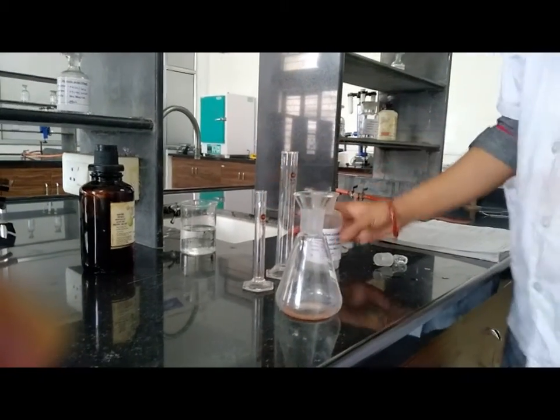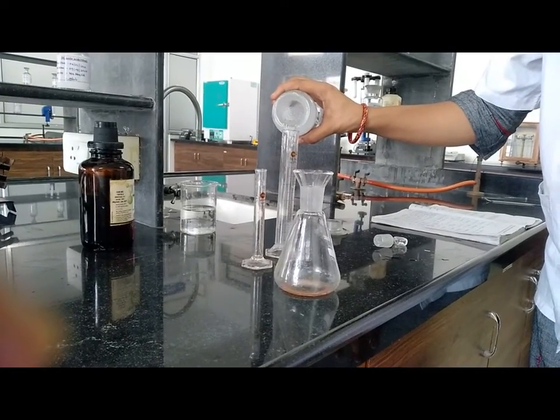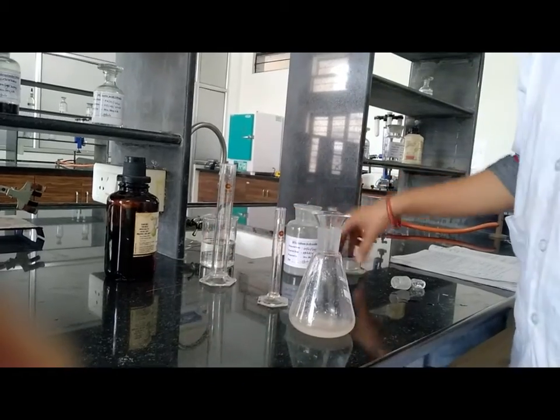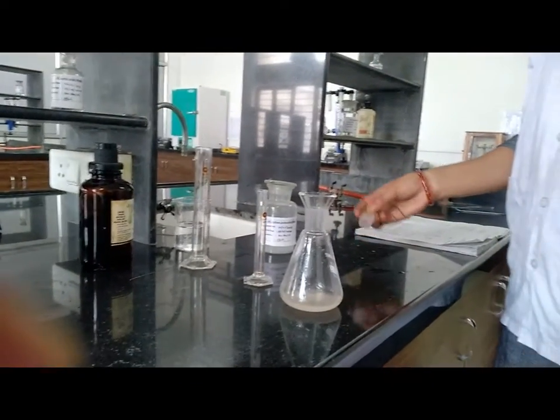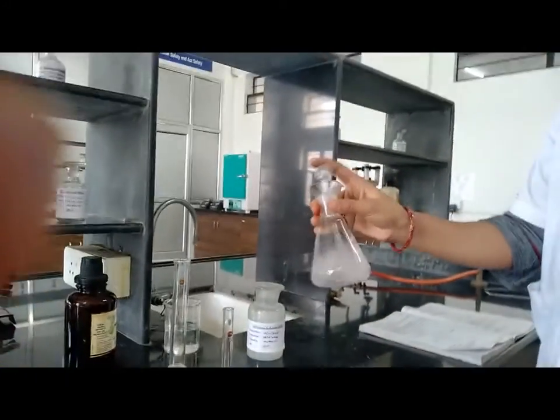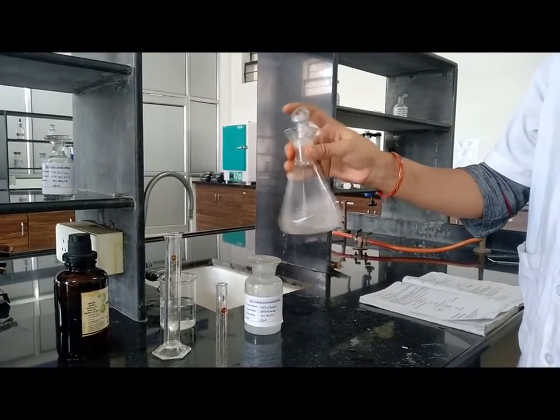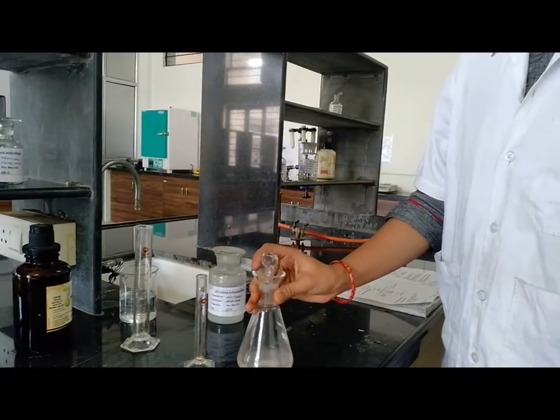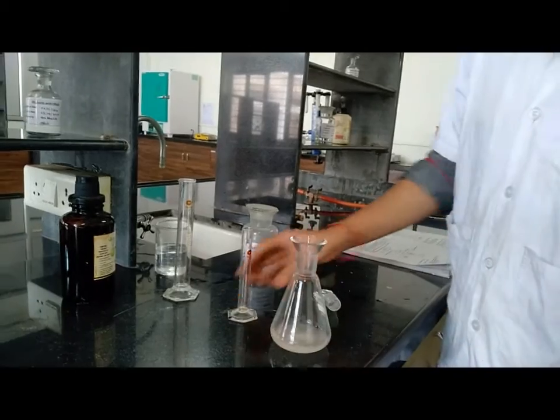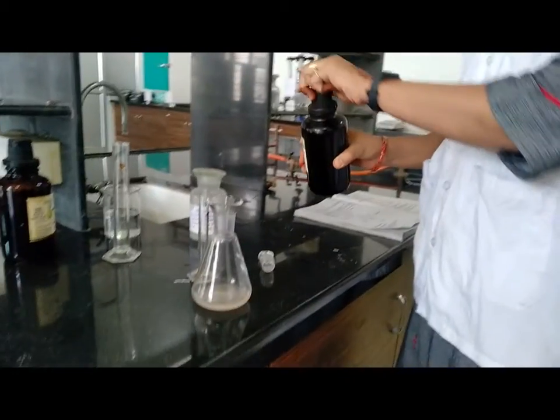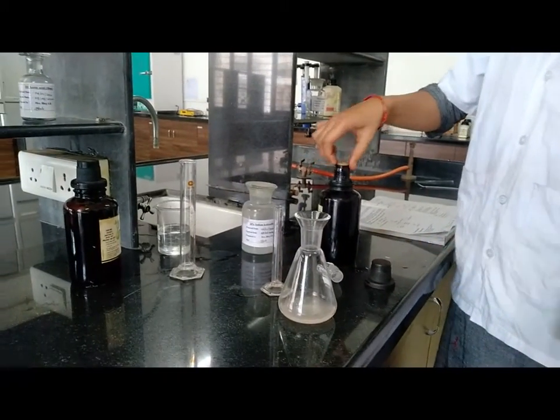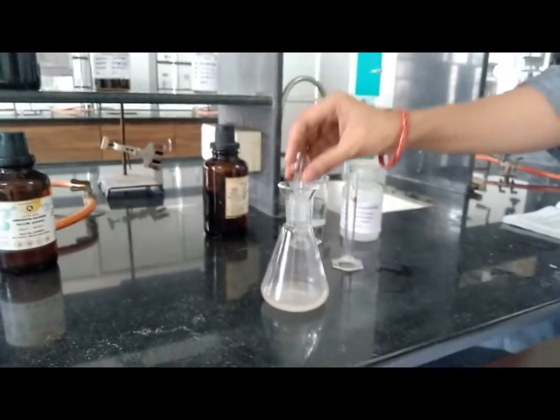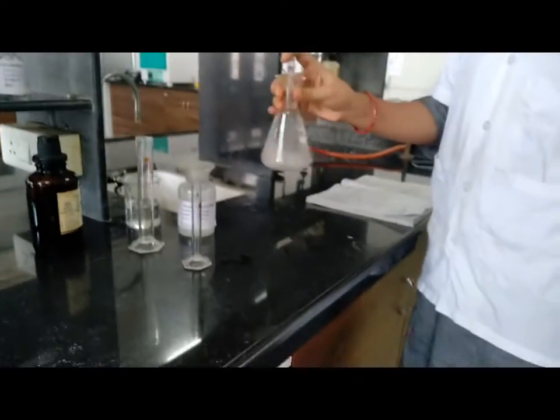And add 30 ml of sodium hydroxide solution. Now stopper the flask and shake it continuously. Now add 4 ml of benzoyl chloride solution. Again stopper the flask and shake it continuously for 15-20 minutes.